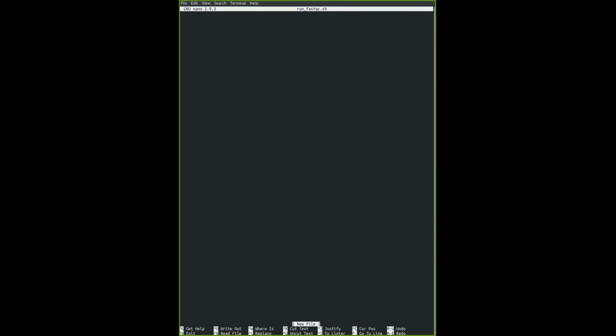I'm going to start off with this very weird instruction, which is a very primitive instruction, but it does have its function right now. Not all programs will use this line, but it's sort of a norm for people to include this code. It's a hashtag followed by an exclamation mark followed by /bin/bash, like this.